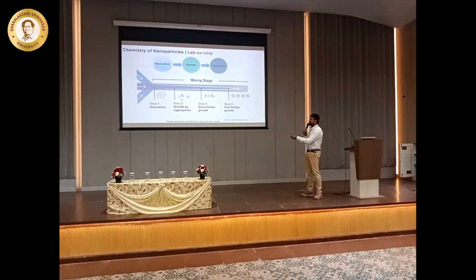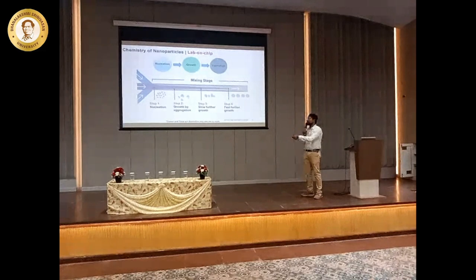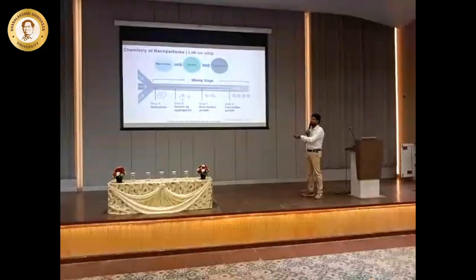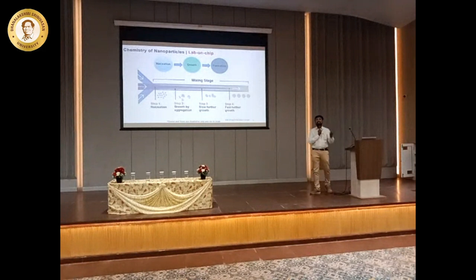Now I'm giving small molecules, or precursor materials, that travel across these channels, and the laminar flow and the turbulence flow will definitely help in making a small diffusion that's happening within the fluids, and it creates beautiful nanostructures in this regime. Right now you see there are 3 different structures, and all are getting connected into a purple color, and then it's converted into a gray, which means there is a formation of something. Right? So this is how the bulk reaction is going to convert into microfluidic structures.